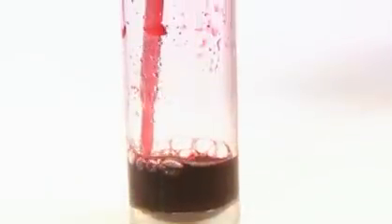Gone are the days when you needed a white coat to do analysis. Now anyone can do unlimited tests on must and wine with Önefos, the revolution in wine analysis.